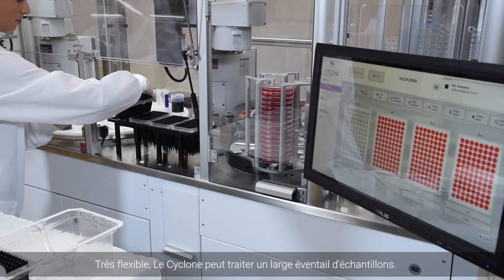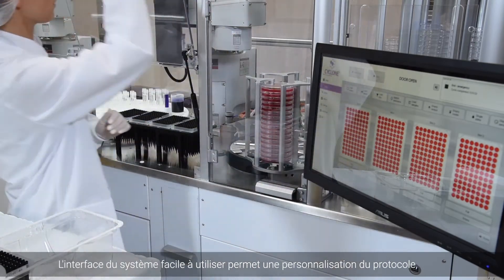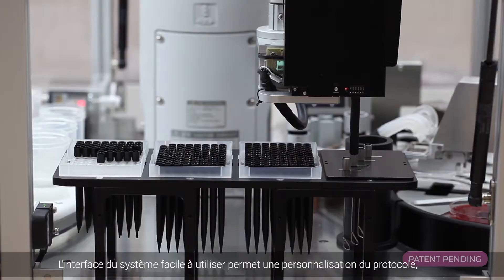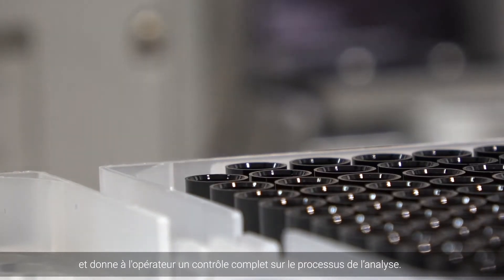Cyclone has the unparalleled flexibility to process a wide range of sample types. The system's easy-to-use interface allows for detailed protocol customization and gives the operator complete control over the testing process.